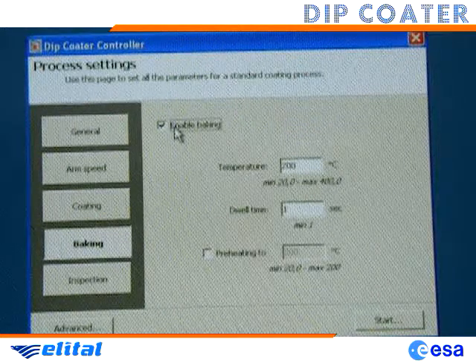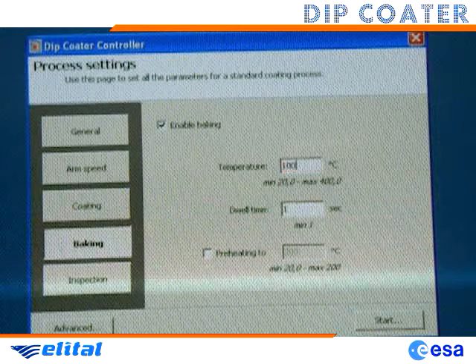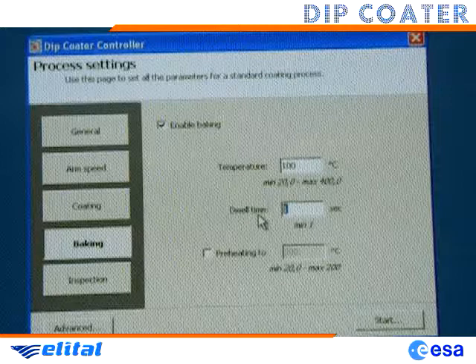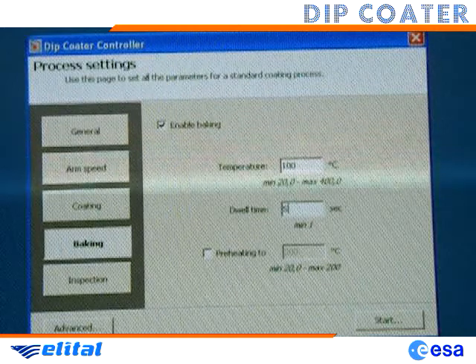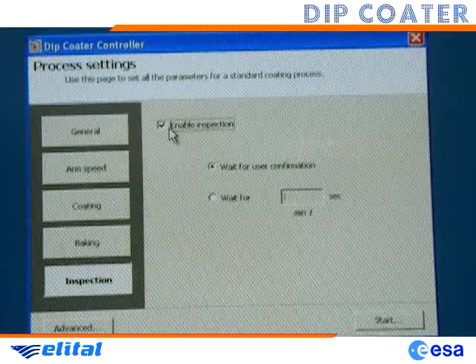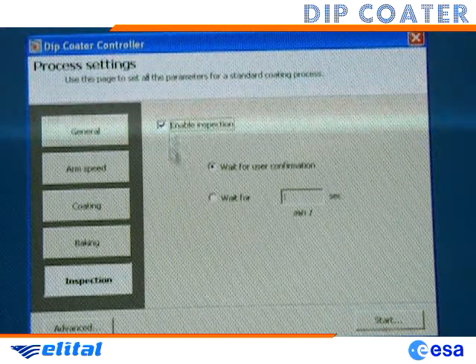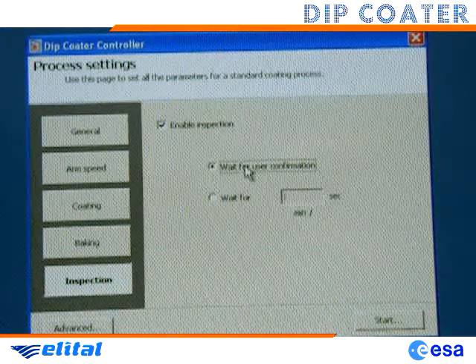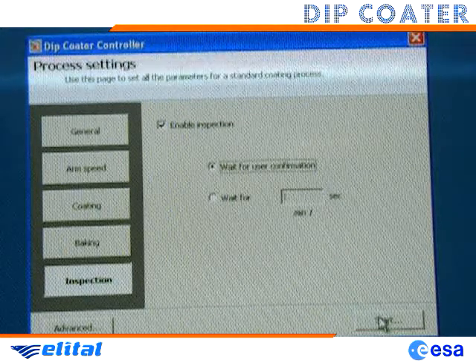In the baking page, we enable baking, then select a 100°C oven temperature, and finally set a dwell time of 5 seconds. Activating baking enables the inspection page. We go there and enable inspection. We want to manually confirm to go on with the process, so we check the wait for user confirmation option. Our process setup is complete, so we can click on the start button in the lower right of the window for executing the coating process.